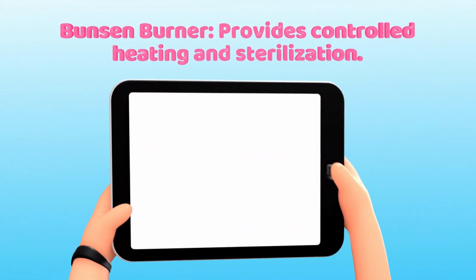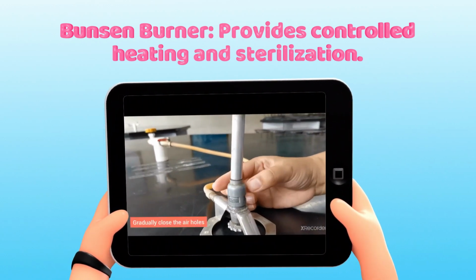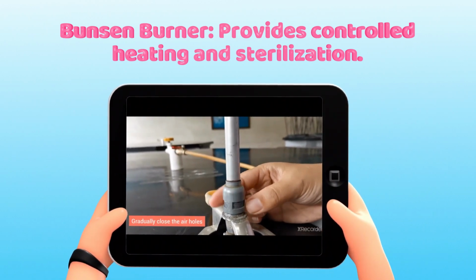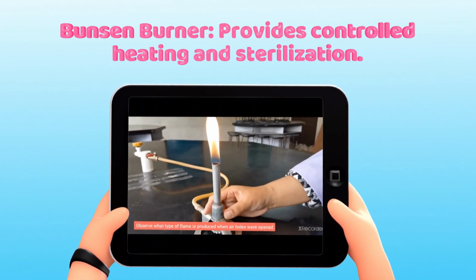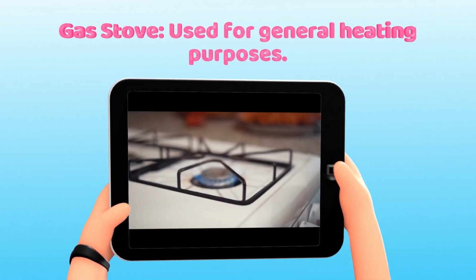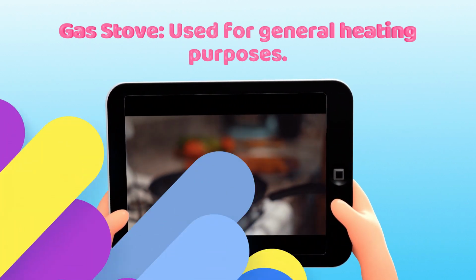Another apparatus is the Bunsen burner. This is usually used for heating purposes under controlled heating. The Bunsen burner is the most commonly used source of heat in the laboratory. Another apparatus is the gas stove. This is used for general heating purposes.